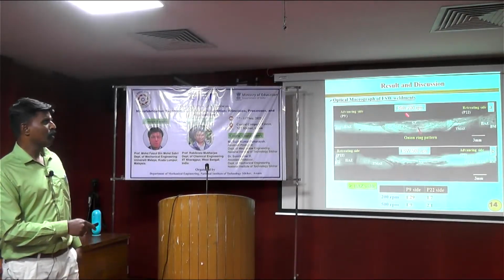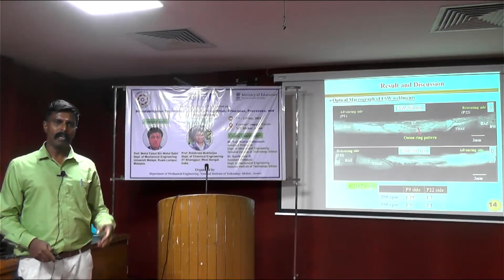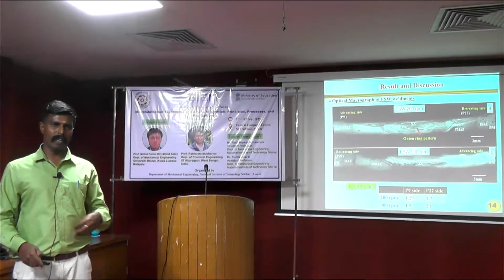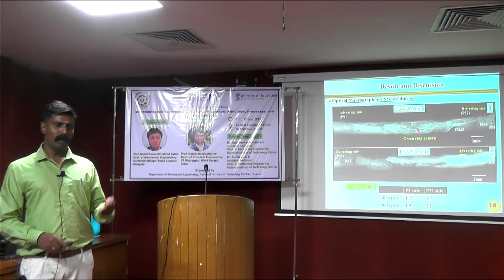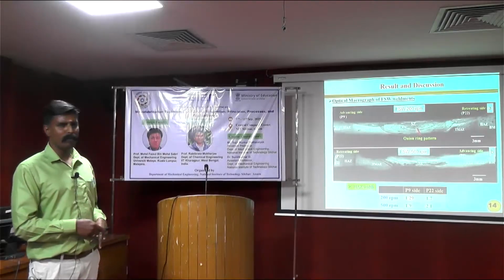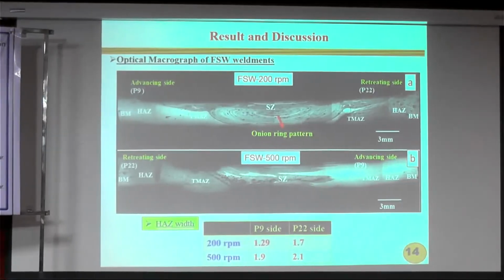So this is the friction stir welding photograph. For the cross-sectional photograph, we have to cut the specimen. Metallographically, we need to prepare the sample via the polishing technique from coarse grade to fine grade silicon carbide emery sheet. Then after that, we have to etch the specimen. Since it is a ferritic steel, we have used Vilella's reagent as an etchant. Then after etching, this is the photograph.